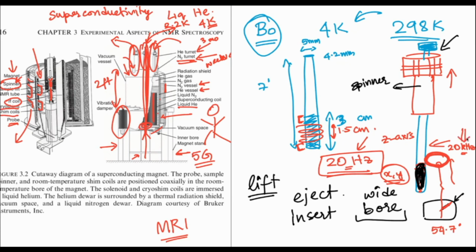But for the solid state NMR, you spin at a very high speed, which is why solid state NMR is almost always called MAS, magic angle spinning, solid state NMR spectroscopy. And generally they are attributed with the spinning speed. In this case, I get 20 kilohertz. There are nowadays rotors that can go up to 100 kilohertz. Solution state NMR predominantly is driven by proton detection. On the other hand, solid state is driven by carbon and nitrogen detection.